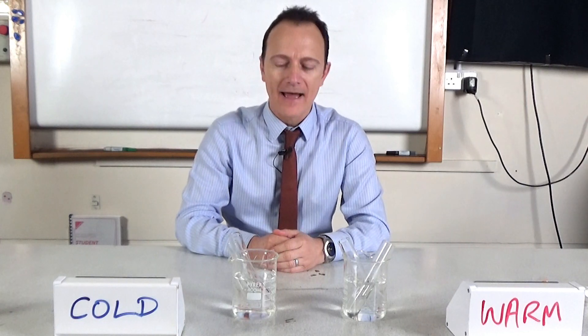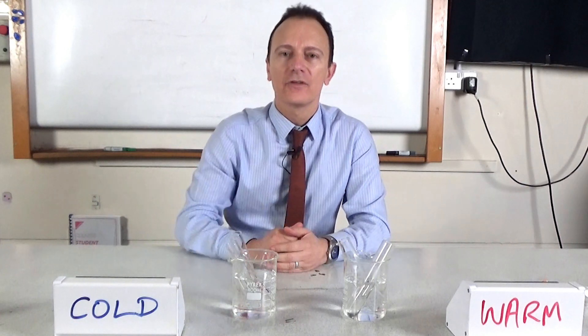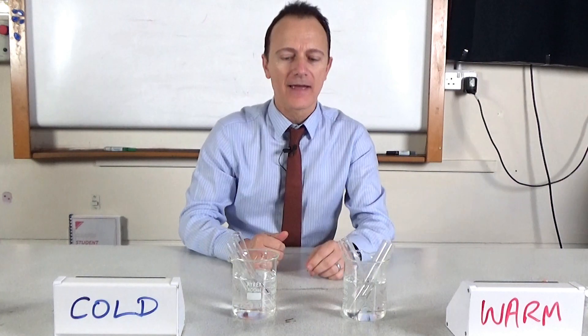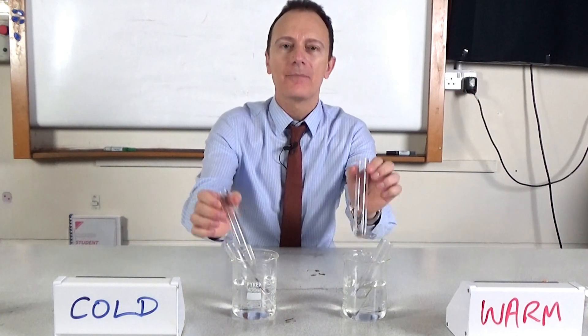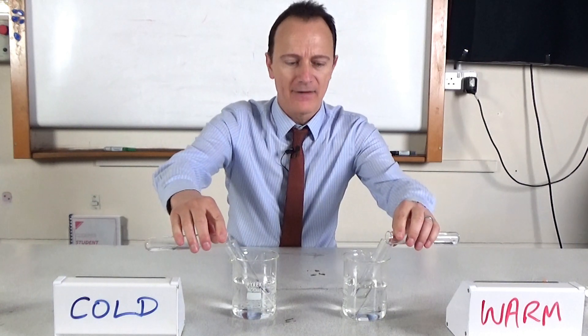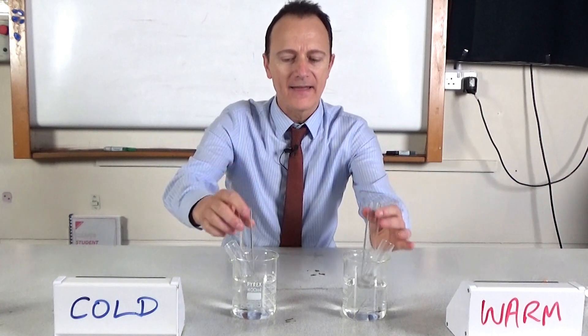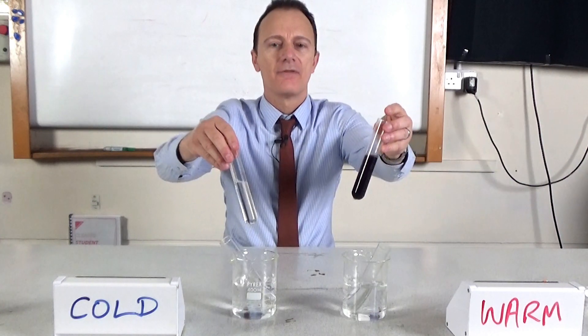I've got two sets of identical reactants. This set of reactants has been sat in some cold water to make it nice and cold, and this set of reactants has been warmed up by placing it in some warm water. I'm going to mix the reactants together now, and then we're going to see what effect the temperature has on the rate of reaction.